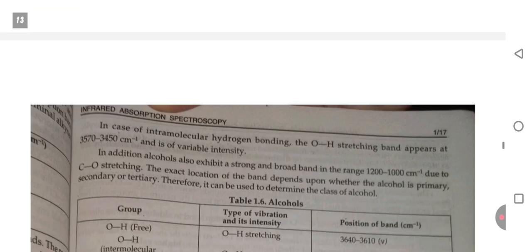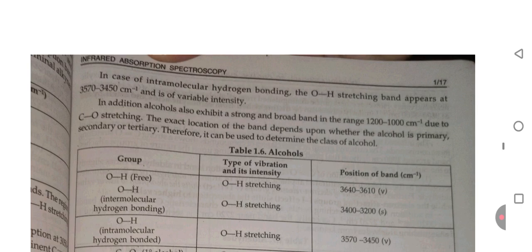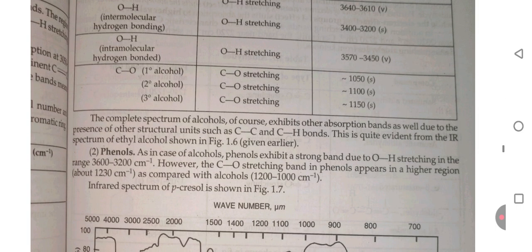In case of intramolecular hydrogen bonding, the OH stretching band appears at 3570 to 3450 cm⁻¹ and is of variable intensity. In addition, alcohols also exhibit a strong and broad band in the range 1200 to 1000 cm⁻¹ due to C-O stretching. The exact location of the band depends upon whether the alcohol is primary, secondary or tertiary. Therefore, it can be used to determine the class of alcohol.